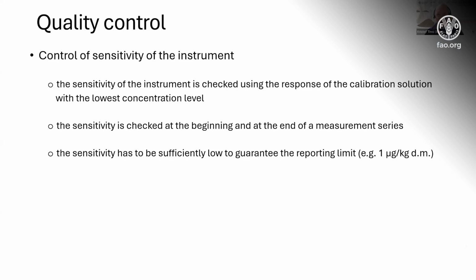Okay. And then the question, what are the typical variations you would expect in these kinds of interlaboratory trials related to the PAHs? And is there a lot of difference between the different compounds?